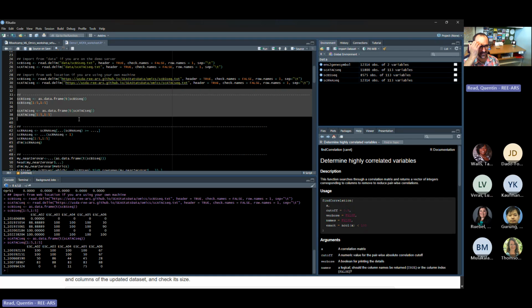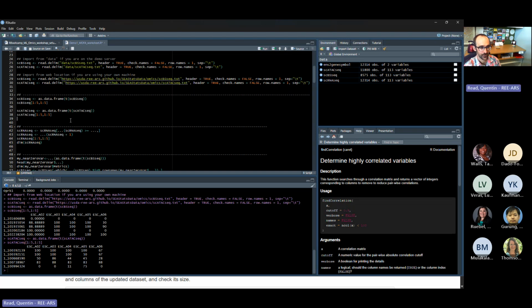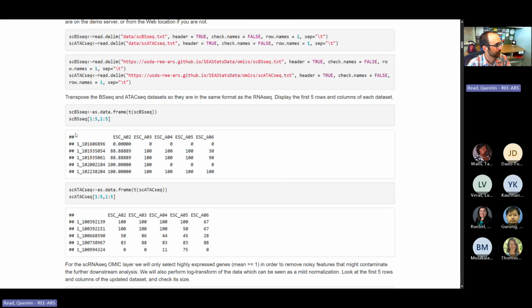Good. So it seems like maybe it just didn't download the first time or something. I don't know, like if the connection timed out or whatever, it might have to try it twice. Okay, so you're all good? I try to run it. Let me know if you're not good. I'm not getting the table, but you're saying okay, there it is. It's just slow. Okay, I got it. All good? Yes. Sometimes when I'm on Teams, it uses a lot of the processor, and then everything runs slowly. Thank you. Okay, cool. You're welcome.